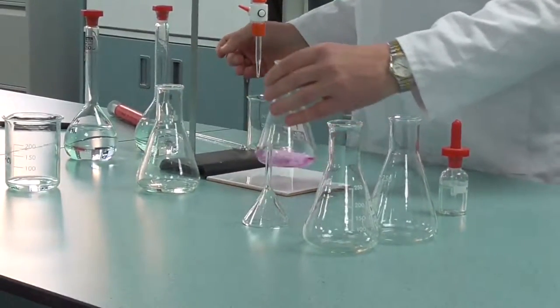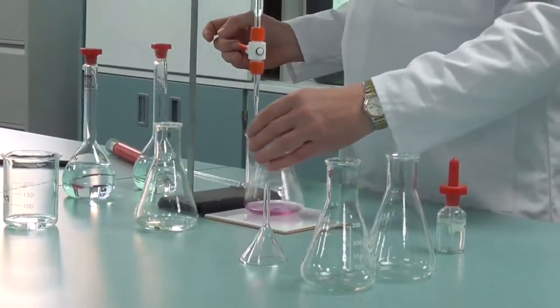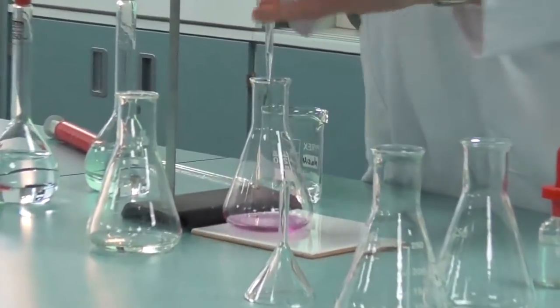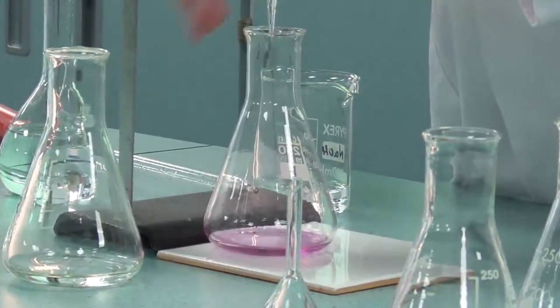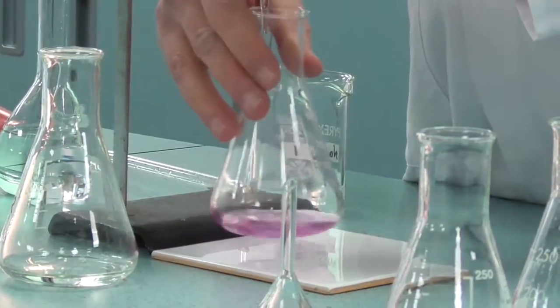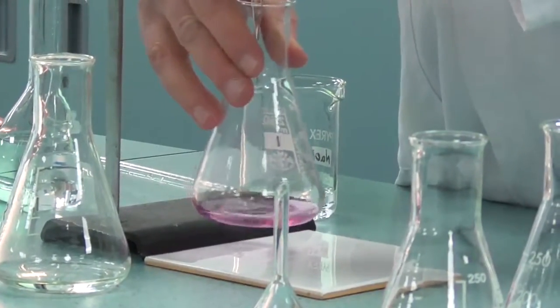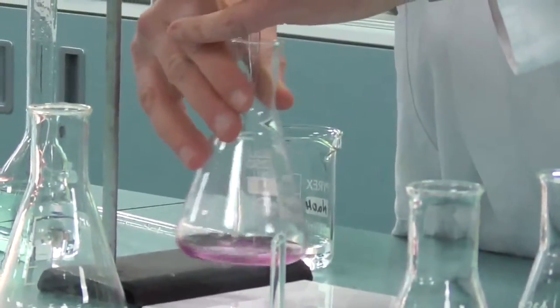And now we swirl it. So we now do our titration again, putting your hand behind and swirling with your right hand. Your left hand, just turn it round, and we now run it in.